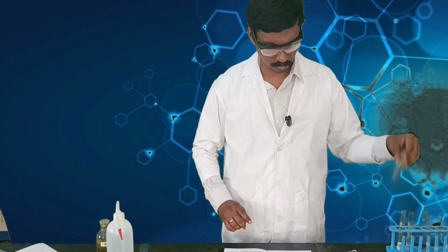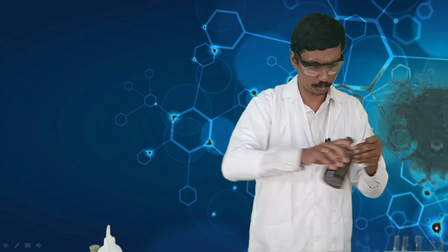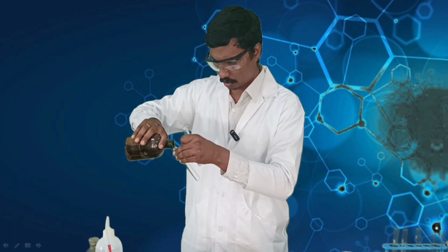Similarly, you can also test for unsaturation by taking some amount of the substance and adding a very dilute solution of KMnO4. I take 2-3 drops of KMnO4, dilute it, and then add this diluted KMnO4 to the compound, and if it decolorizes, it tells you that it's an unsaturated compound.